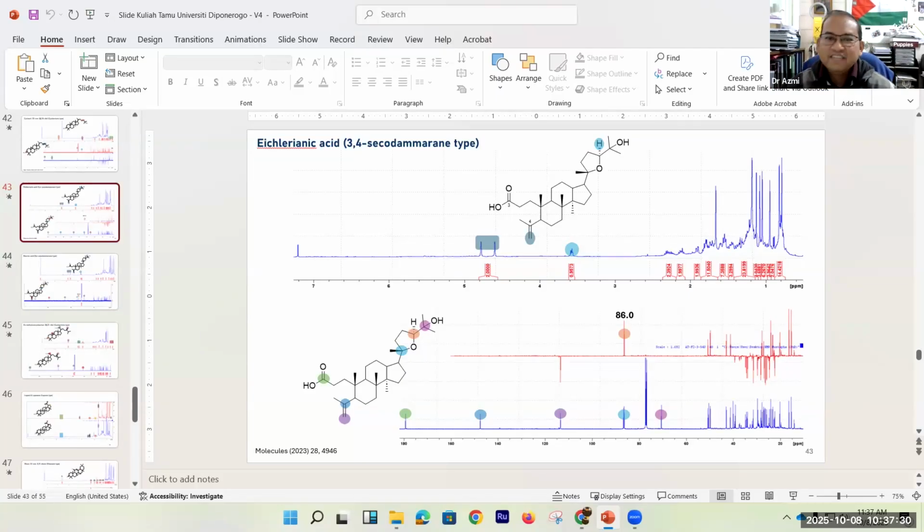And there's one thing I remember: we still have the sample in your lab. I'm thinking we could use this MixONat for prediction on the sample, maybe because of the limitation of the isolated compound. Is it possible to use this MixONat to predict the compound that we've already isolated?